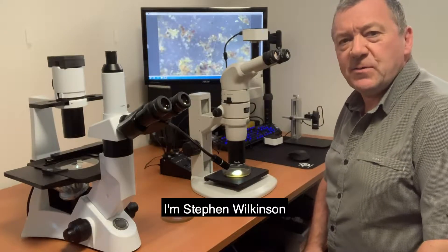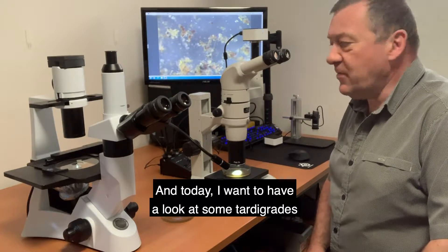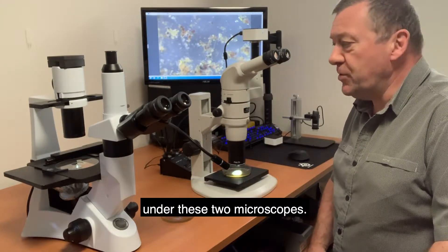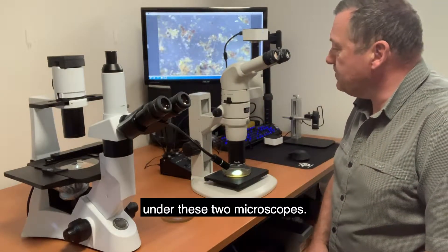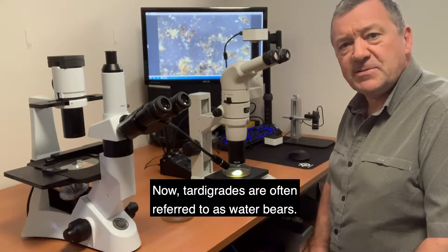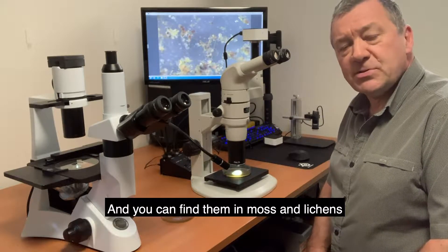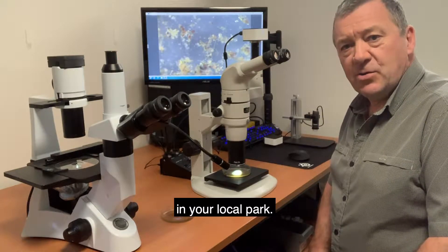Hello, I'm Stephen Wilkinson from microscopes.com.au and today I want to have a look at some tardigrades under these two microscopes. Now tardigrades are often referred to as water bears, and you can find them in moss and lichens in your local park.